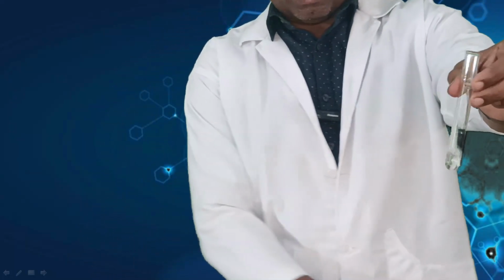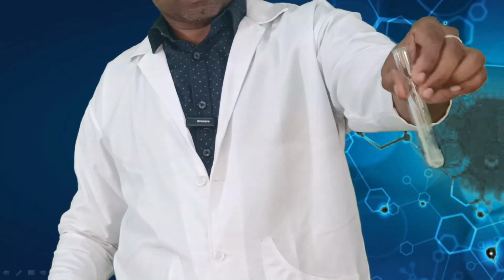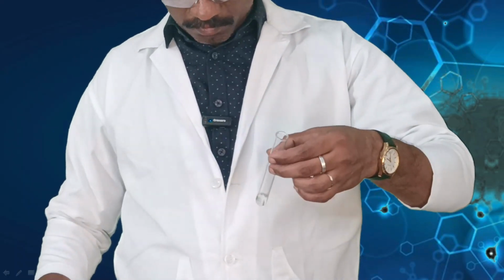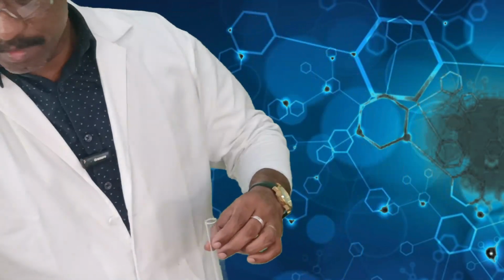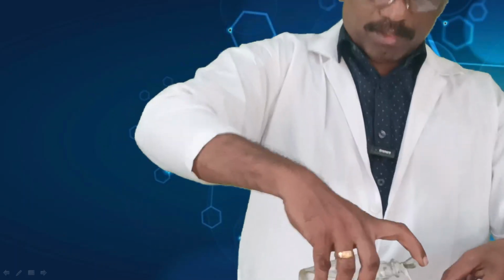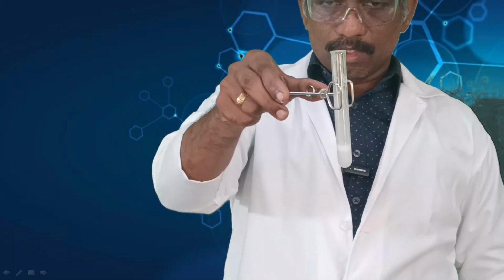Okay. When you add HCl to this, the dissolved acid will get regenerated. You can see the formation of a white color precipitate.